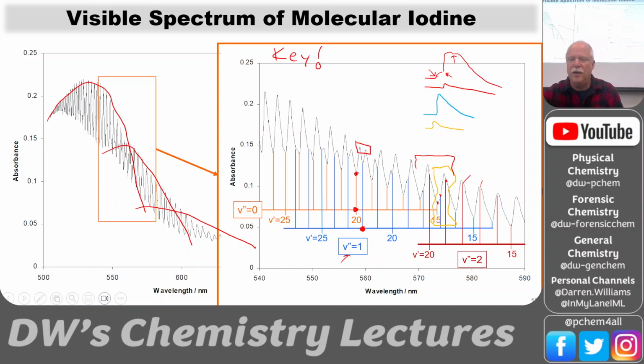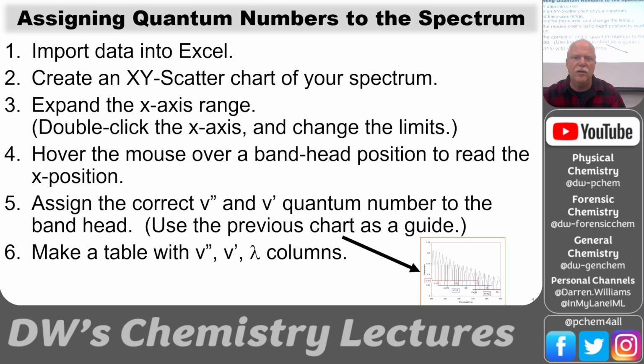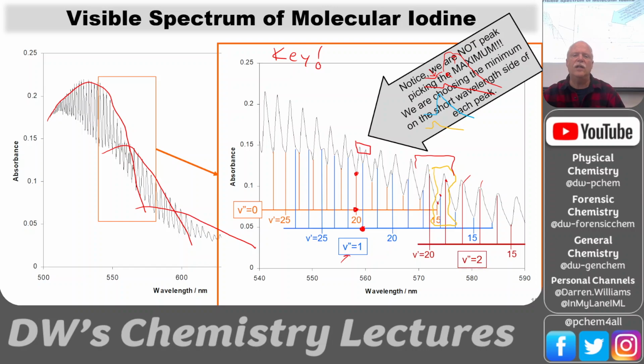But you can use your judgment, get in there and hover. So this is how we do it. We're going to get close to these. Well, let's see. First, okay. We'll revisit peak picking, but first we got to get the data into Excel.